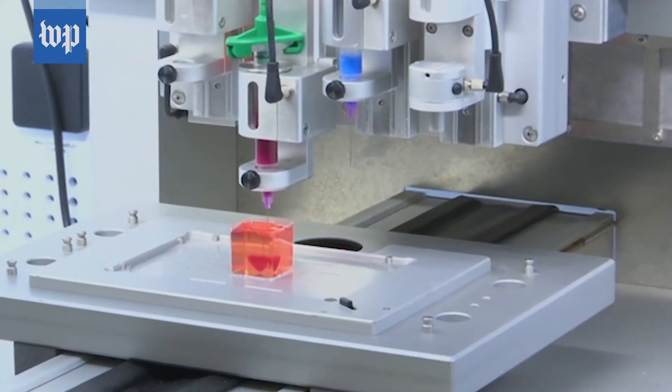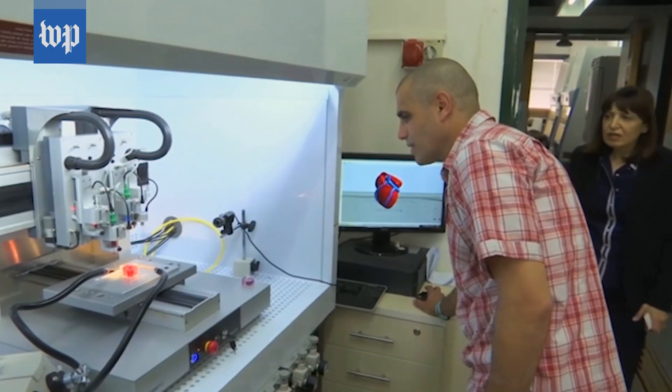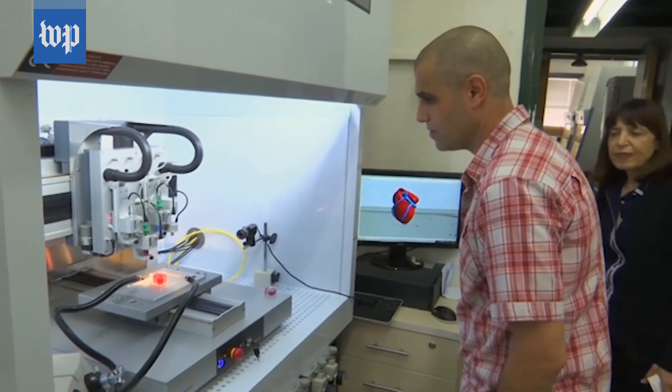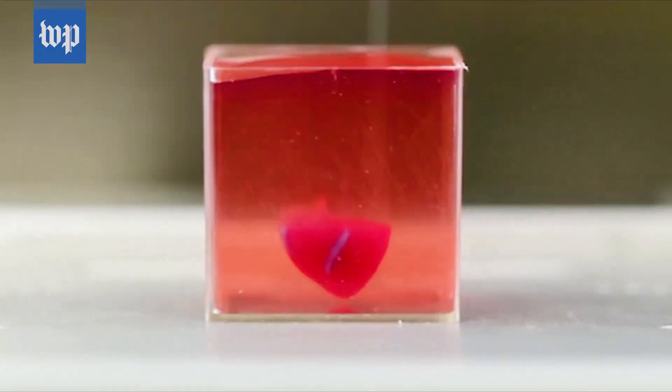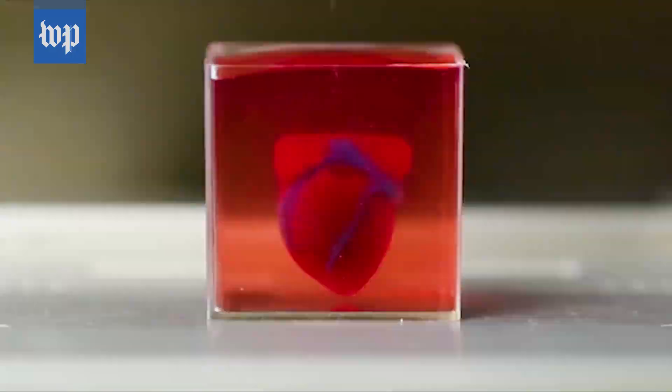The cells are reprogrammed to become stem cells and then differentiated to become cardiac cells and cells that form blood vessels. The biomaterial — the collagen and other sugars in the tissue — is processed to become a bio ink.